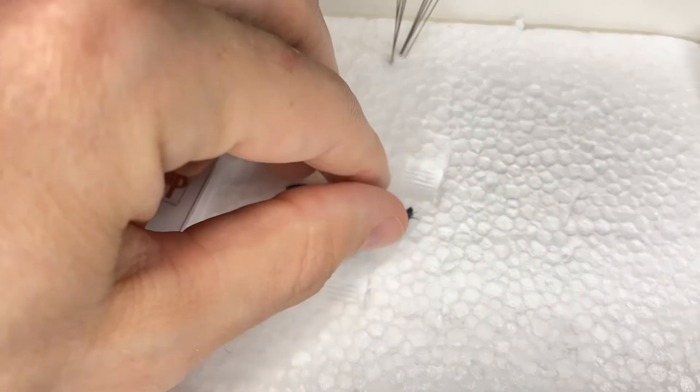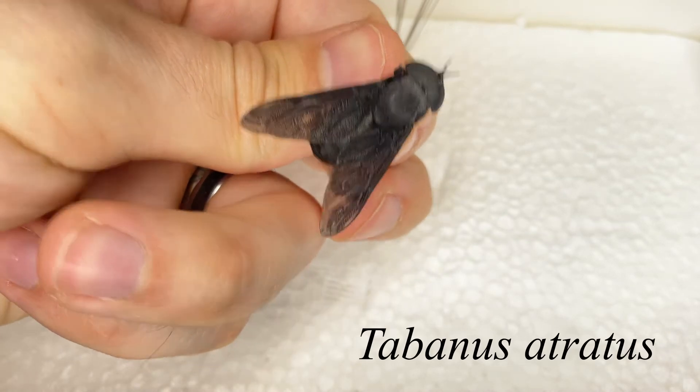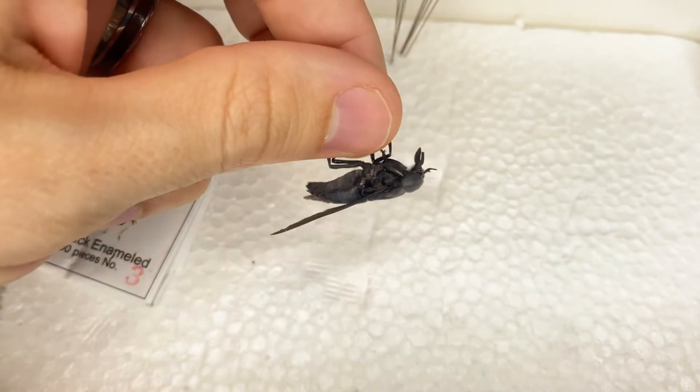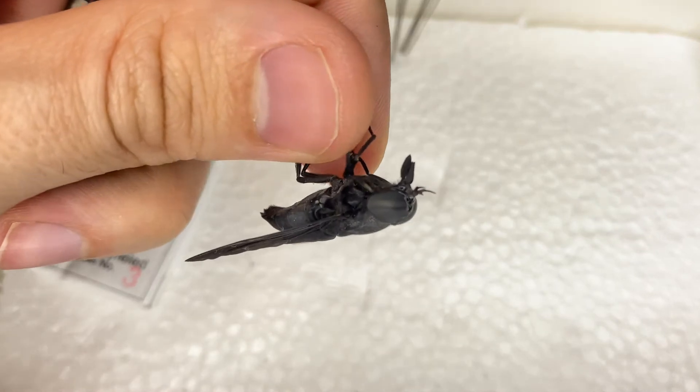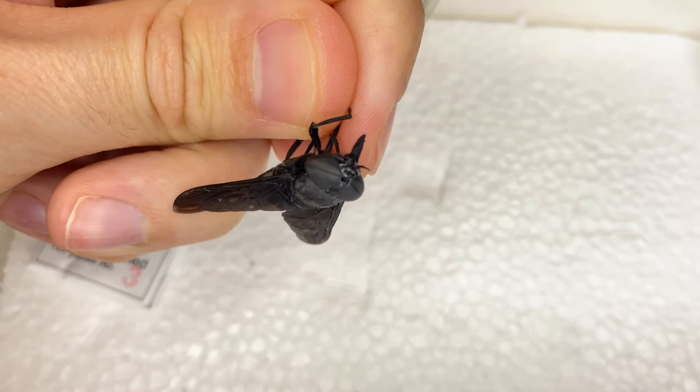To pin our bug, we also need a bug. I have here a black horsefly — I believe this species is Tabanus atratus. It's a pretty big fly. Don't let it bite you. There are mouth parts, and look at those beautiful eyes. I love horsefly eyes.